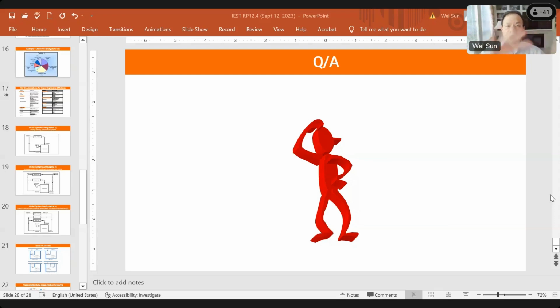We send all the data and plot these curves of particle concentration on a screen. We have a mathematical calculation in our program and algorithms, so a real-time room average particle concentration is shown on the screen. Then we look at the 24 hour timestamp to see any variation when we change the temperature inside the space.